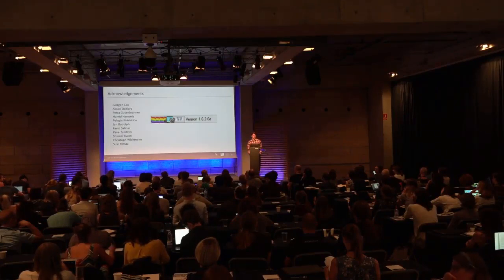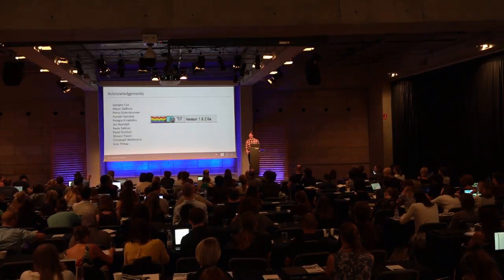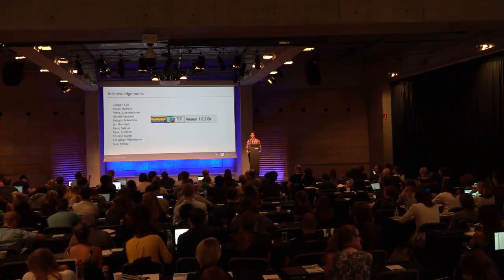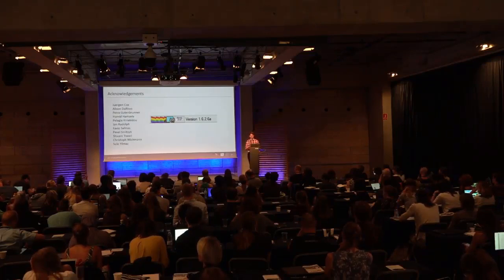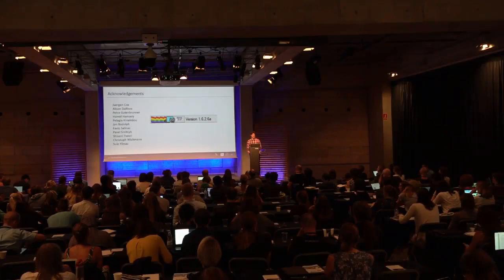I don't think you would necessarily get many more phosphopeptide identifications using that strategy. I can't think of a way that it's possible to do that in MaxQuant, to turn off standard peptide identification and just keep STY. You'll see in MaxQuant there are fixed modifications, but that can't be used for phospho-STY because then MaxQuant will expect it to occur on all serines, threonines, and tyrosines. Okay, thank you.